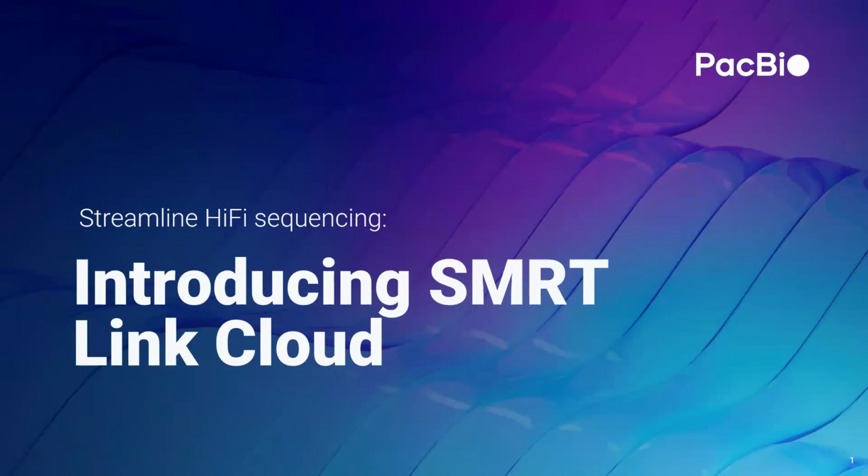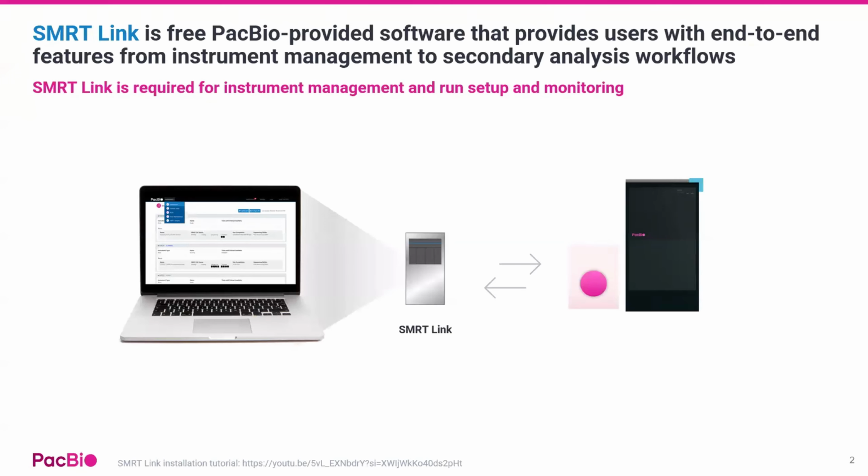All right, and now we will start with introducing SMRT Link Cloud. Before jumping into our new cloud option, let me first introduce you to SMRT Link. SMRT Link is PacBio's free software that is required for both Revio and Vega instrument management and creating sequencing runs. It is a Linux-based software that is compatible with Rocky and Ubuntu operating systems, and the software is installed via on-premises Linux server and accessed by your local browser. See our SMRT Link installation tutorial on our YouTube page.